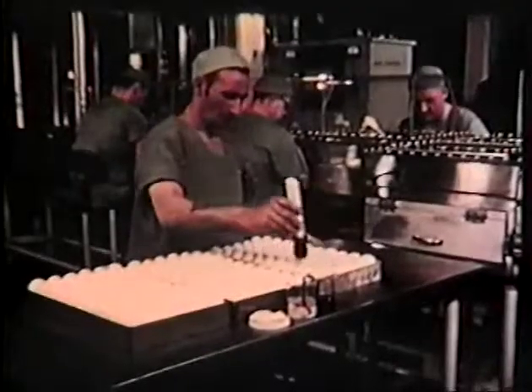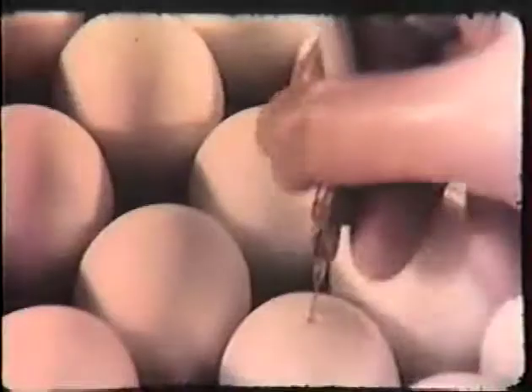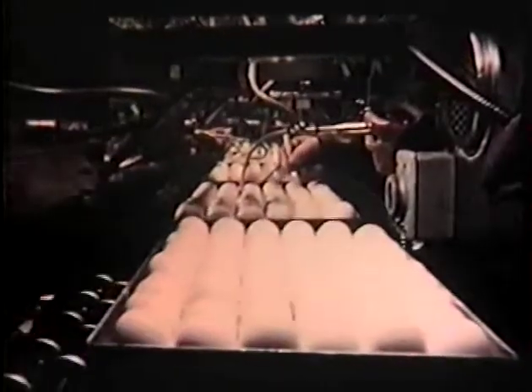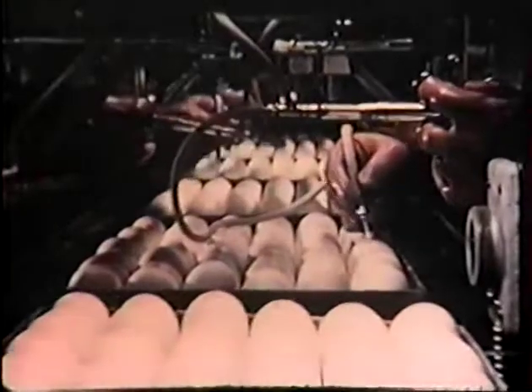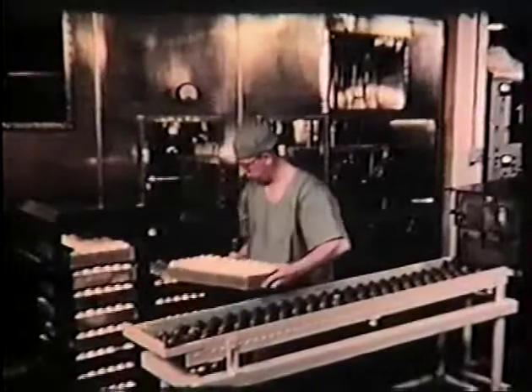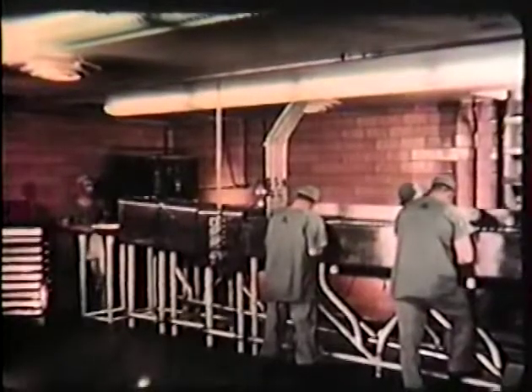A small amount of the virus is injected into the eggs. Depending upon the organism to be produced, the eggs are then incubated for a period of 1 to 10 days. During incubation and growth of the embryo, the virus multiplies to more than 12 million times the original number. Parts of the embryo richest in the virus are processed to get a very concentrated culture of organisms for further research.